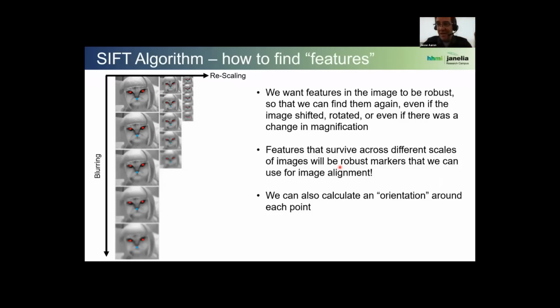Doesn't necessarily mean that it doesn't have its weaknesses, but I think it's the one that, if you were going to look more deeply into this topic, is probably one of the first things that you would see. This is called the SIFT algorithm. It stands for Scale Invariant Feature Transform. It was proposed by a guy named David Lowe, a number of years ago now. It's a very powerful technique in that it finds features in an image that are distinct, that we can then use to match similar features in the next image.